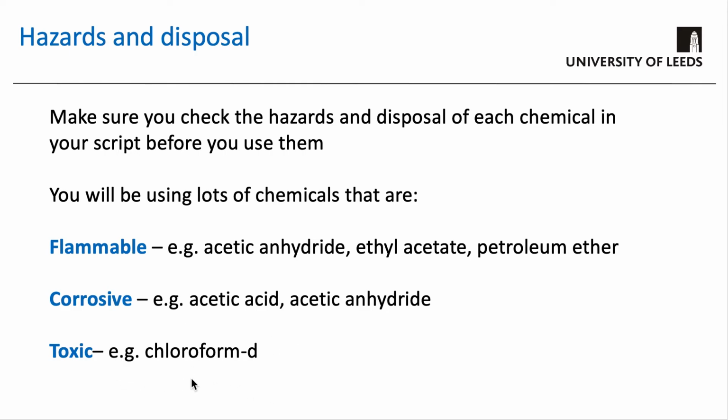And some chemicals like the chloroform D that you're going to be using to make your NMR sample are toxic, so you need to make sure you do not breathe in any of these fumes from the chloroform D, so make sure you only handle this in a fume hood and not outside the fume hood itself.